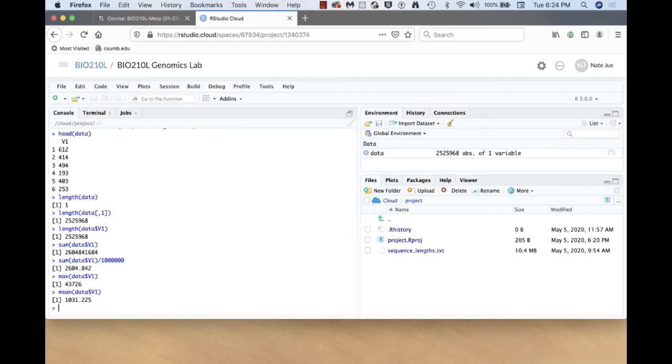And we can ask, how variable were these results? We can look at standard deviation and look at that first column. Again, here we can see that the standard deviation is actually even wider than the mean. So it looks like there's a lot of variation in this data set. It's a highly variable data set.